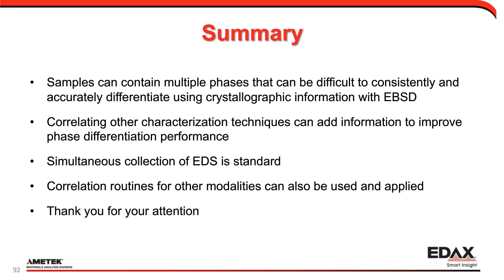Similarly, within OIM Data Collection, when you reload a data set, there's now an option to set up your KAI scan. The big difference between those two is that TEAM uses the full spectrum available, where OIM Data Collection is only limited to the elements you selected during your mapping. You also have the option of doing your KAI scan now in OIM Analysis.